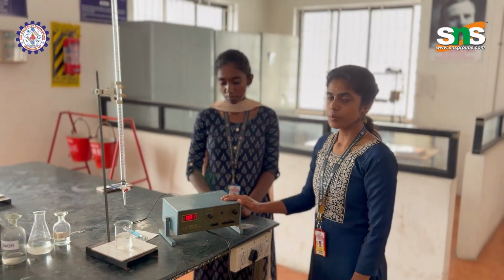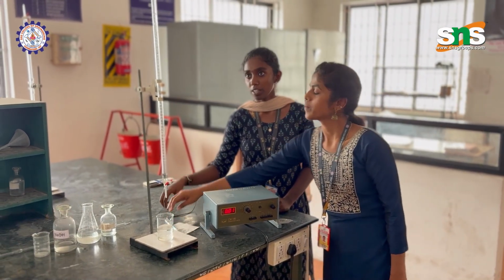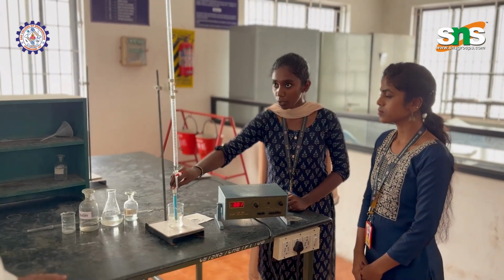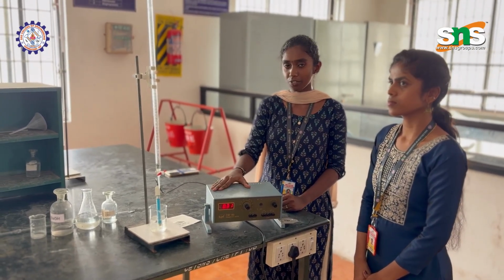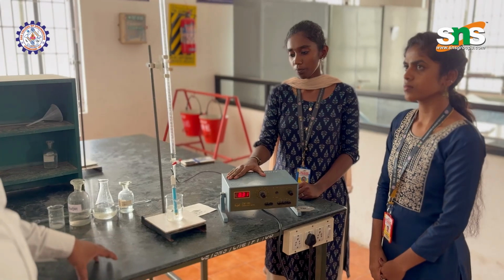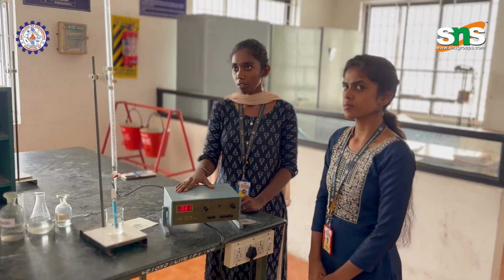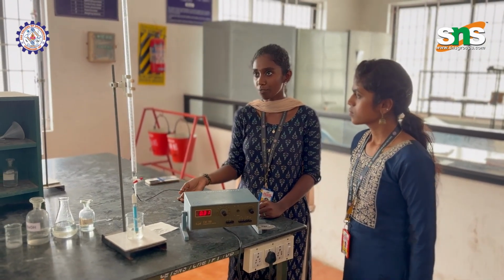Okay. Any other things? Let us discuss how this experiment works. This is a conductivity meter, and this is a platinum electrode or conductivity strip. Do you have any cell constant for that? Yes, sir. We have the cell constant. It is 1.0. By dipping the electrode in the given solution, the mobility of the ions will be detected. The ions will be moving, and the electrode will measure the mobility, and based on that, the conductance is shown. By detecting these points, we can represent it in a graph.